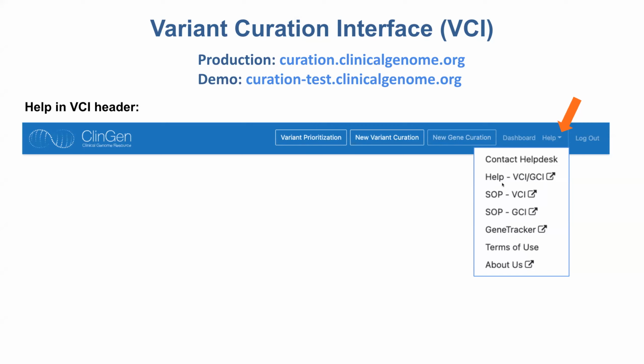If you click on that, there is really extensive documentation here that we keep up to date with all the latest features of the VCI. If you go there and have a look, it really does walk you through exactly how to use the VCI. It's all in Gitbook. It's really clearly laid out for you.